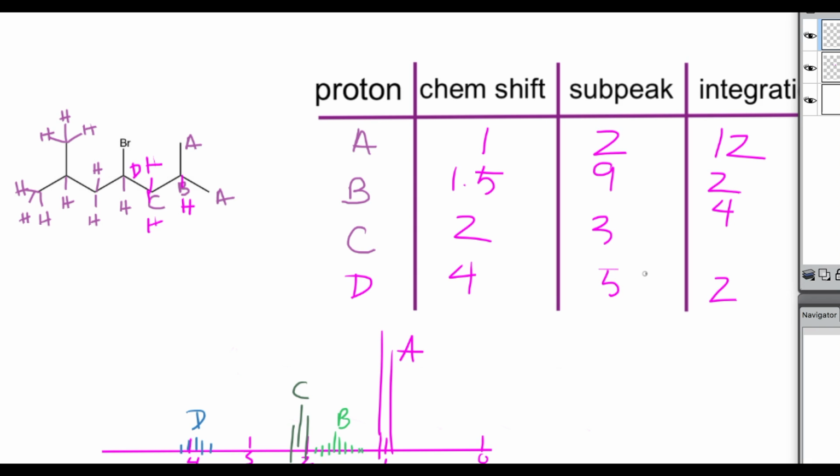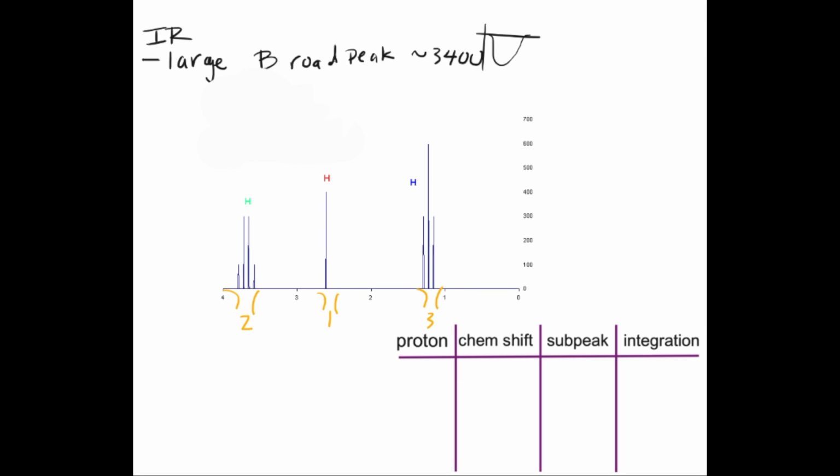This should complete the NMR spectra of what you are expected to find when you run the machine. You can take an NMR spectra and build a molecule from it by making a table and piecing the hydrogen environments together.